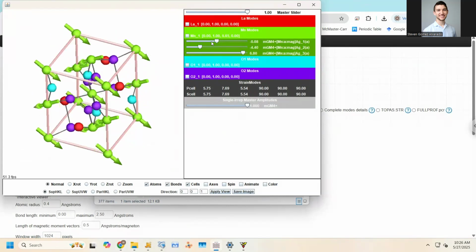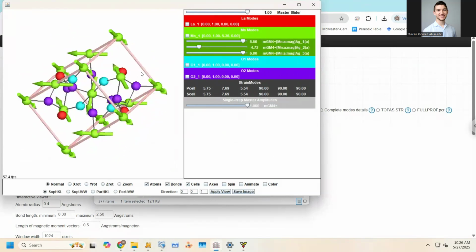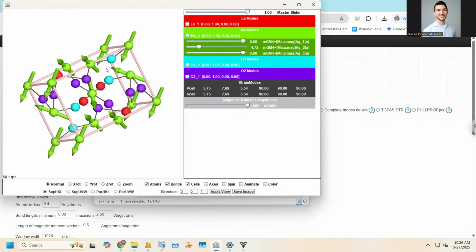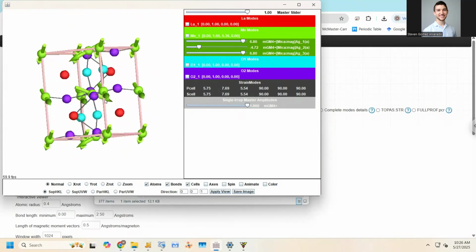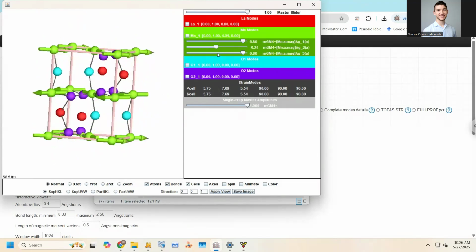And you might have a superposition of multiple of them. So this should give us enough degrees of freedom to capture any sort of magnetic order that would follow, I guess, what I might call naively the rules of symmetry breaking that are allowed in this gamma 4 irrep.